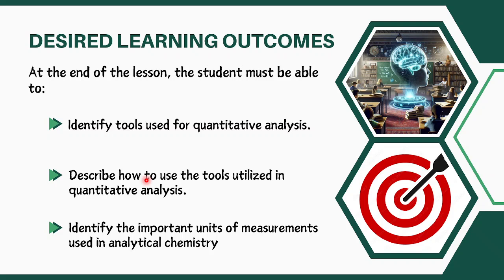Now, this video discussion will be made up of 3 parts. The first part talks about the chemicals, the proper handling of chemicals. The second part will be all about the apparatus, and then the third part will be all about the unit of operations.